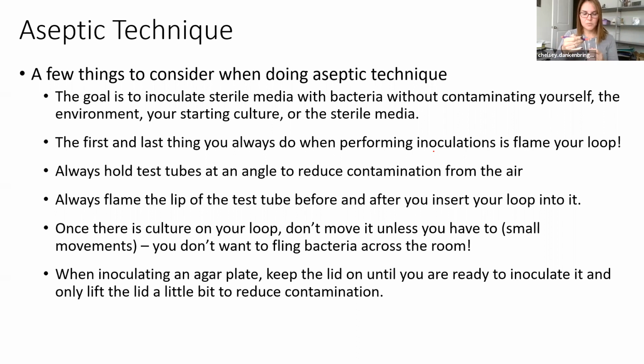But during this time, we need to get the lid off of our test tube. You normally want to loosen your lids in advance. And so here's where things get exciting. You want to use your pinky finger to remove the lid from your test tube. And notice I'm holding my test tube at an angle because I want to minimize the air contaminants that can gain access to my test tube. Now you want to sterilize that test tube because it's exposed to the air. So you pass your test tube through the flame, and then you insert your loop and you grab bacteria.